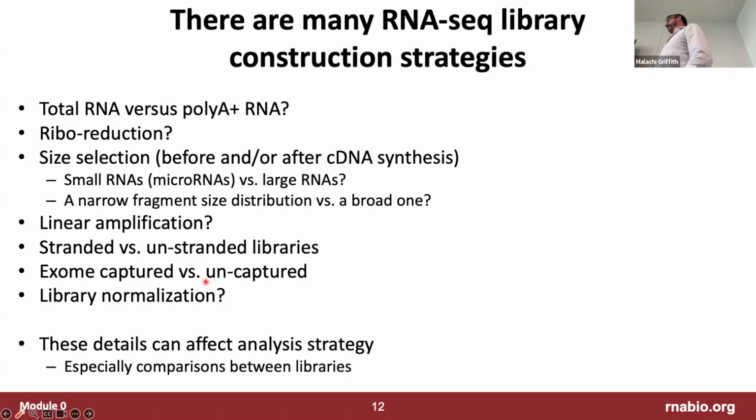Yeah, so it does. And there's been a few papers published about this approach asking that question, like how much does it impact the ultimate readout? And it's surprisingly not that bad, not as bad as you might think. So it does compress the dynamic range. So the highest things become a little less high and the lower things go up, but there's still a wide range. And that range is still highly, highly correlated to the expression levels that you would have seen if you hadn't done that enrichment step.